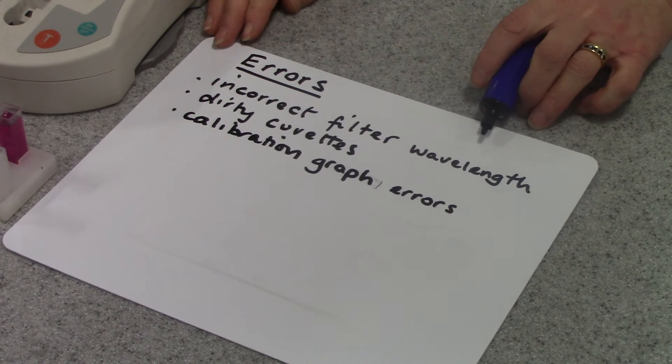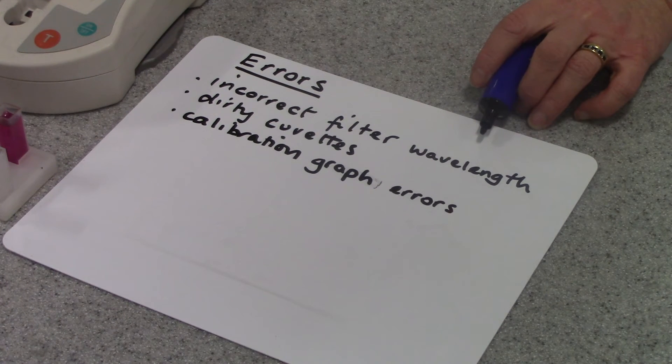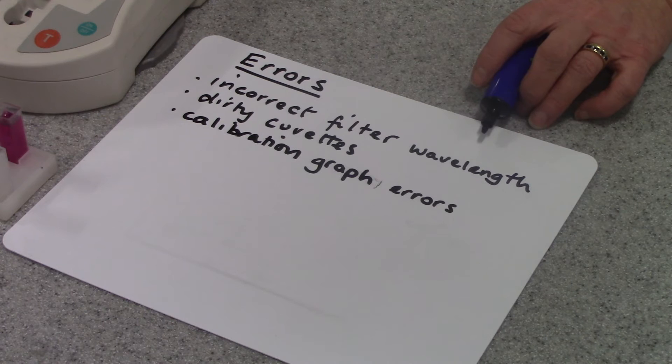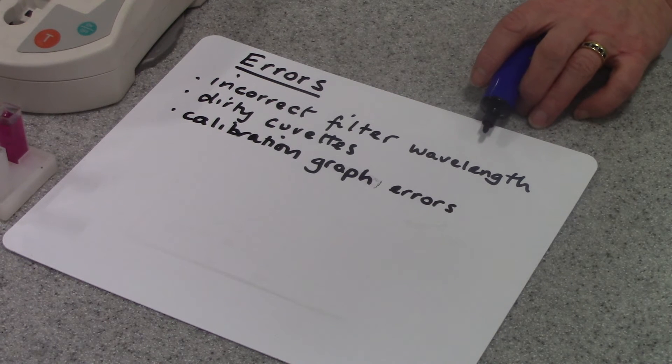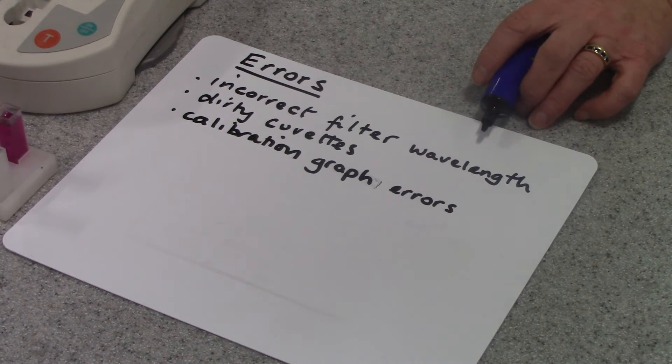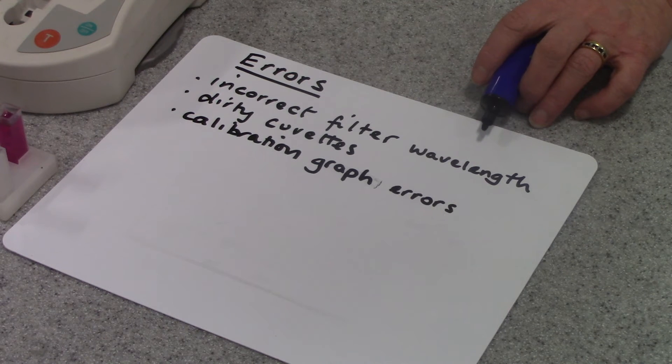The first error is if you haven't set it to the correct wavelength for the color of solution that you are testing. So you need to check that. The other error is using dirty cuvettes or scratched cuvettes. If your solution has any particles in it, precipitate or anything, that can affect your absorbance.